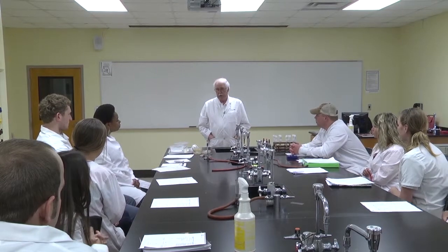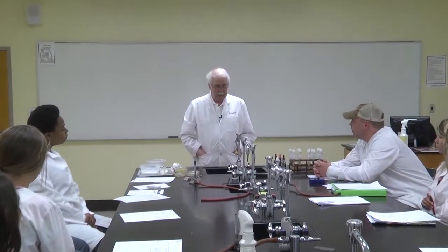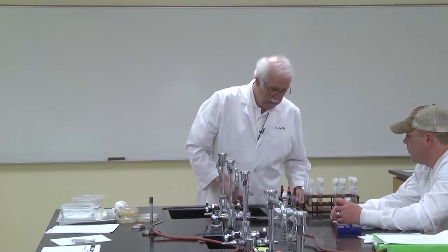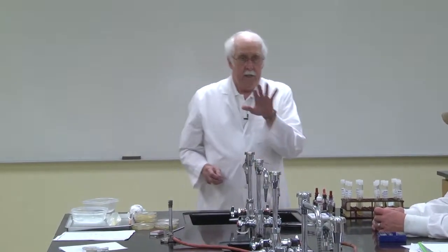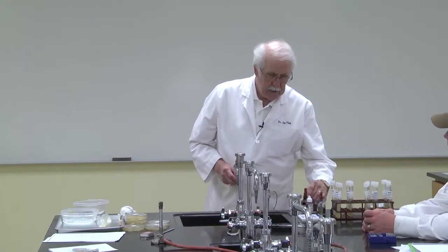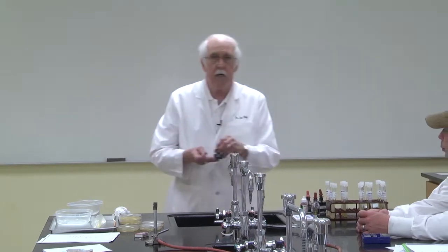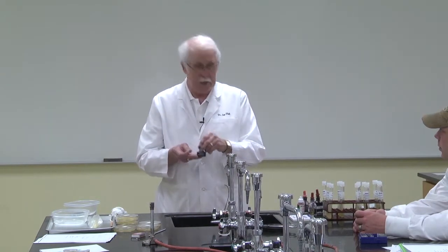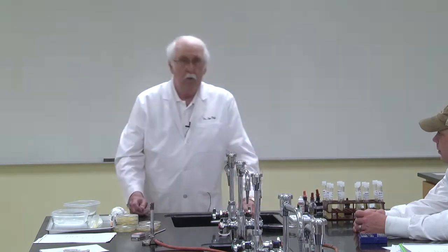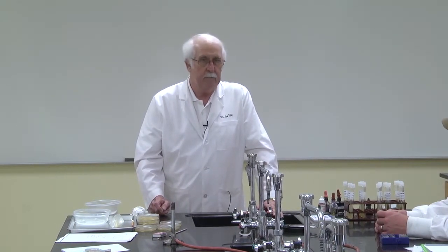The simplest procedure is known as the negative stain, also known as a capsule stain. To do this, we put a single drop of nigrosin at one end of a slide. This is sometimes called a capsule stain. Nigrosin is an acidic stain, and India ink can also be used for this. It's an acidic stain also. With a capsule stain, we also counterstain by using a basic stain such as safranin.